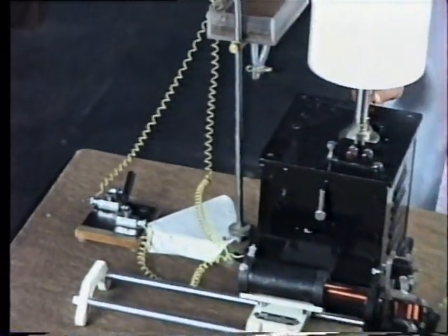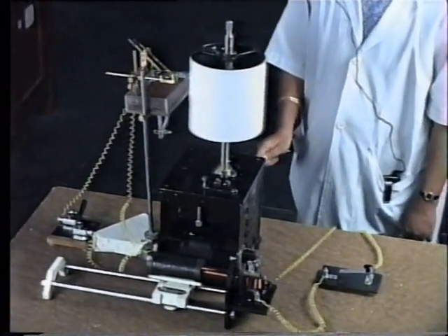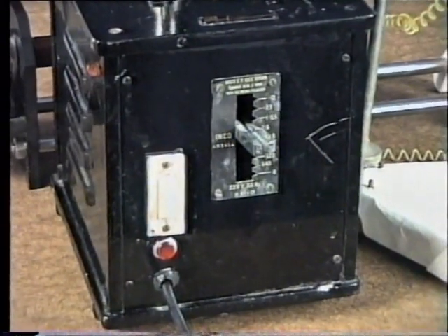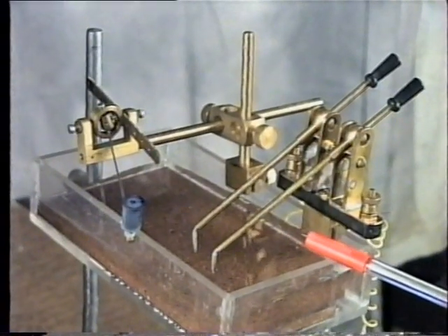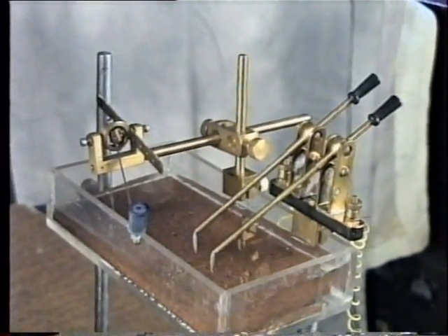This is the Sherrington's apparatus, which consists of the main spindle, a gear system arrangement, a switch to operate, and a drum to record — filled with saline solution. This also consists of the stimulator and the lever arrangement to record.